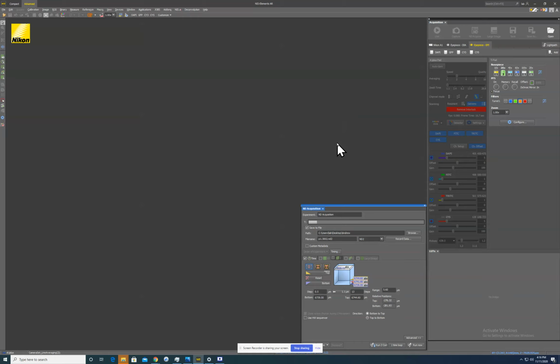about it. Once you're on the eyepiece tab, you have your little tabs here, so DAPI, GFP, Cy3, and as I'm clicking these, it is going through the filter wheel on the microscope itself and changing that epifluorescent light. The filter switcher that's on the right-hand side of the microscope base is also still able to be used. It's whichever you're more comfortable with.